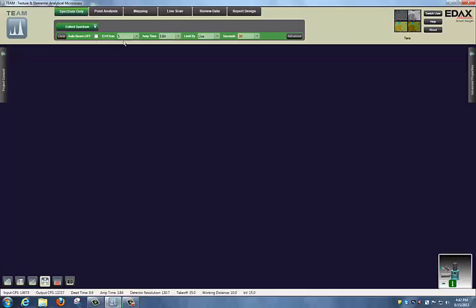The EV per channel indicates the amount of EV per channel in the spectrum. So if you think of the spectrum having an x-axis in terms of energy, the EV is the energy, and the spectrum is comprised of channels. The number of EV per channel shows the spectrum display.